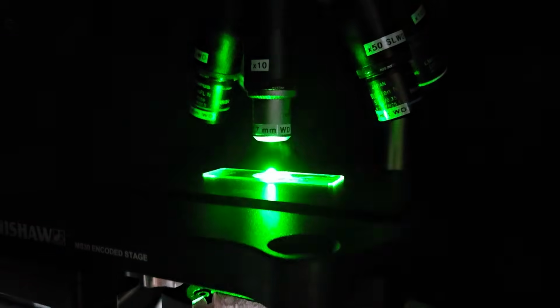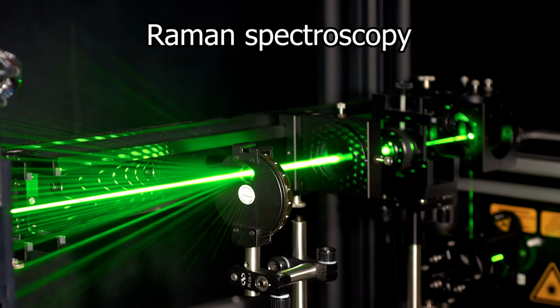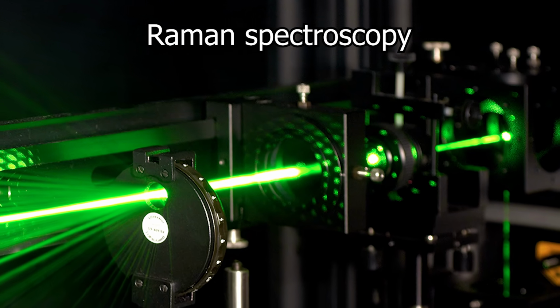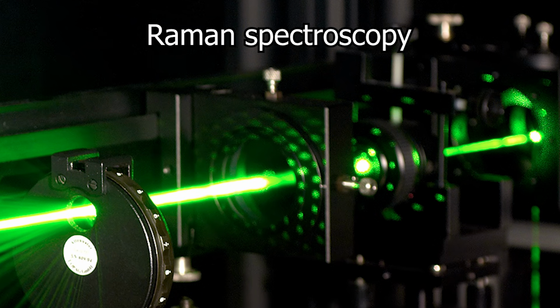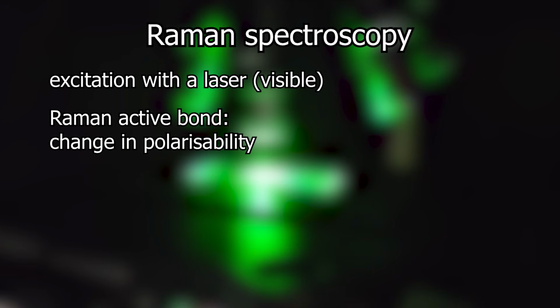A laser beam is shot into a sample and a tiny part of it collides with the matter, changes the vibrational states in the compound, and then the inelastically scattered light, i.e. the light with now less or more energy, can be measured. At first glance, this sounds a bit like IR analysis, but there's a few important differences.